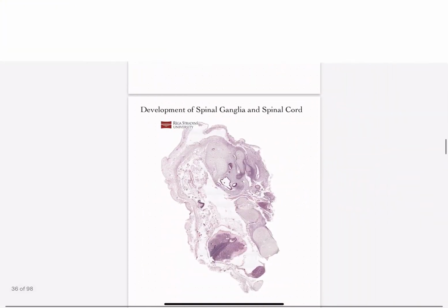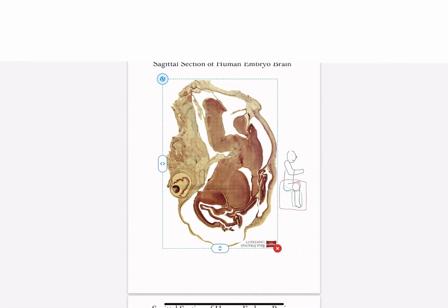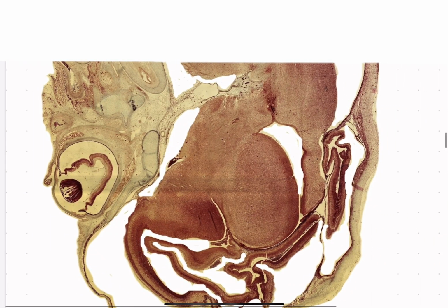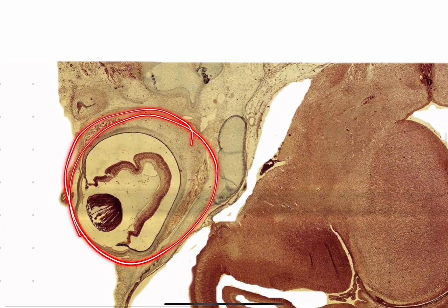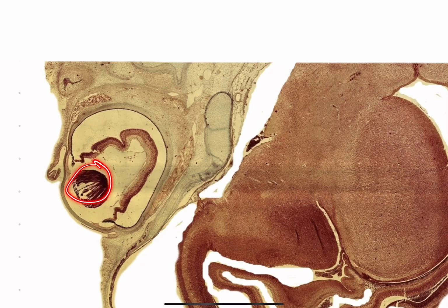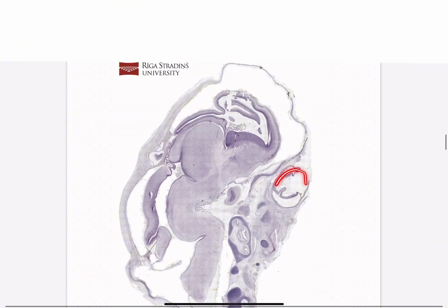Now, if we do look at this from an upside down angle, for example, something like this. In one of my lectures, the slide was upside down, so the chances of it being upside down for your practical colloq might also be very high. So here we see the eye development, and now usually we would go towards the bottom left area, right? But here we have only empty space. Also the placement of the lens being towards the left, or the general eye being towards the left instead of the usual right that we see here.